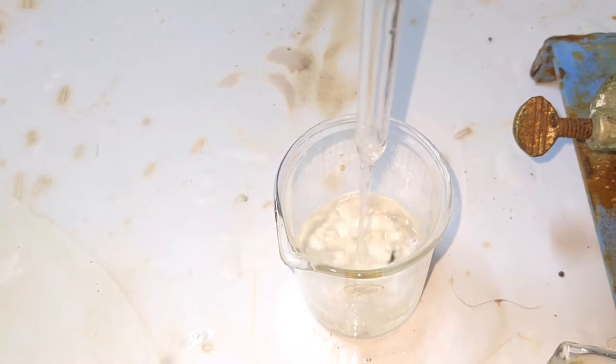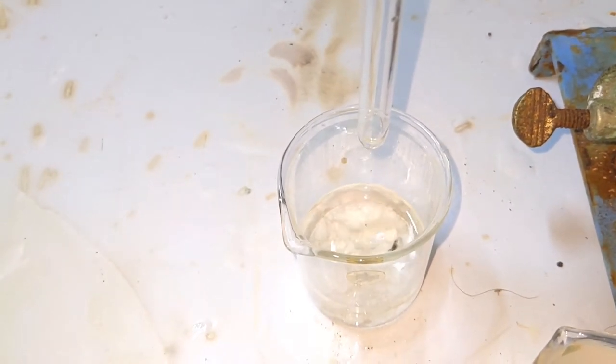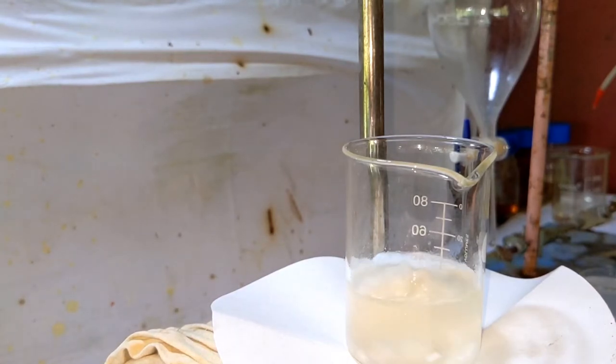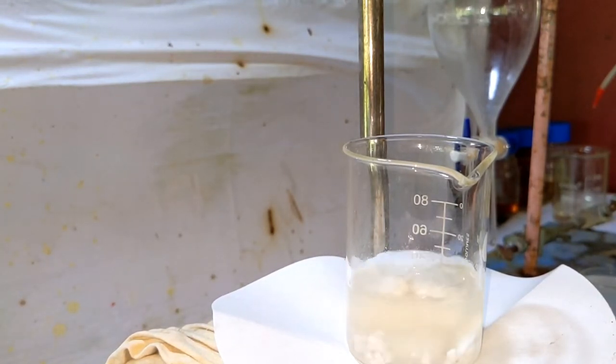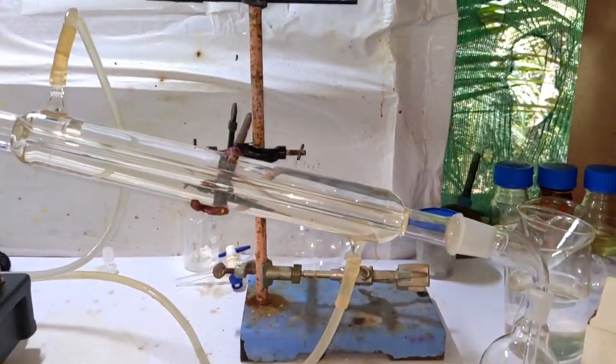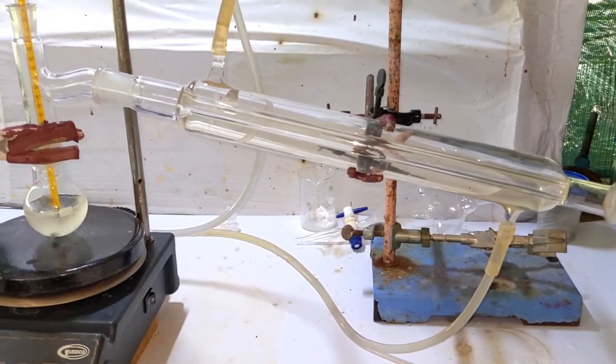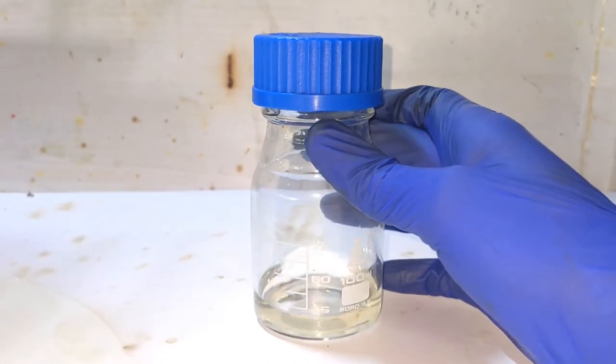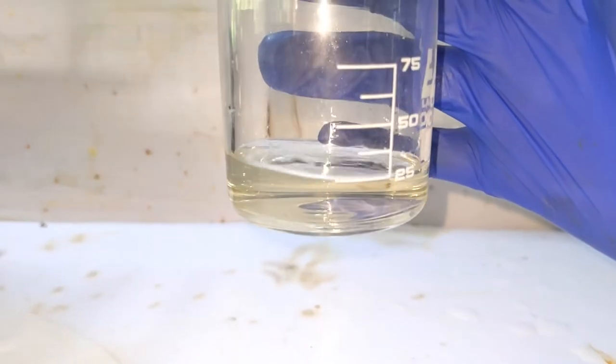Finally, the distillate, the organic layer, was poured into a beaker containing anhydrous calcium chloride, and a second distillation was conducted. Everything below 90 degrees Celsius was collected, and this is the final product. At the end, I collected 25 milliliters of the compound, which represents a 50% yield.